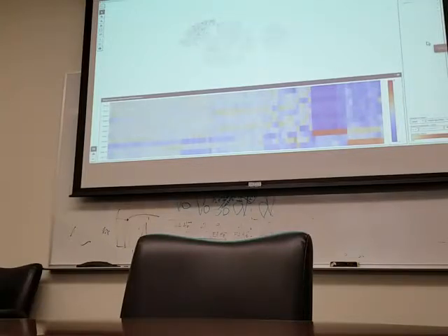So MS4A1. Yeah, that. Okay. And then the 2 CD79s, 79A and B. So this is gonna highlight all of these. Yeah, so those would highlight all the B cells with CD19, I guess.